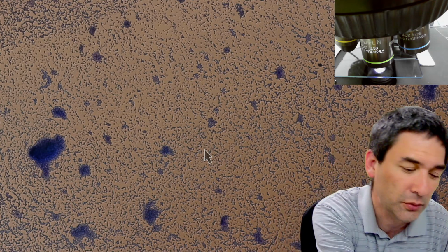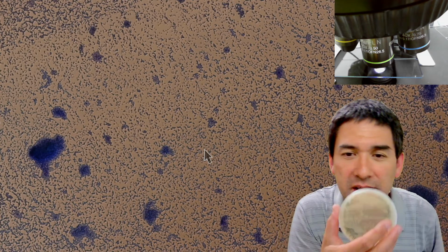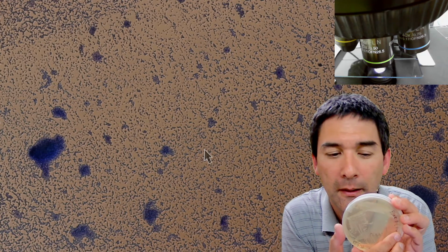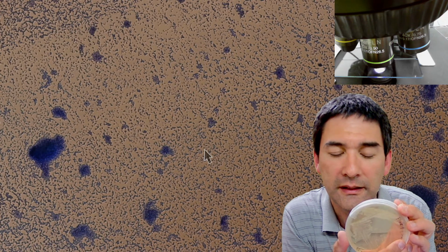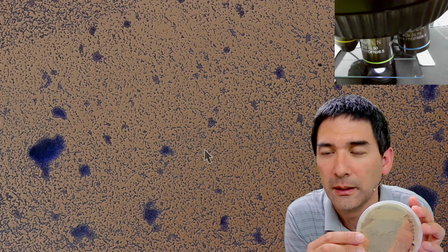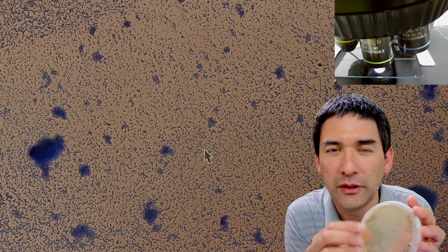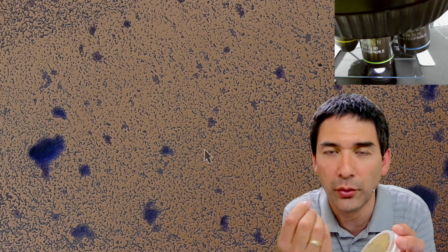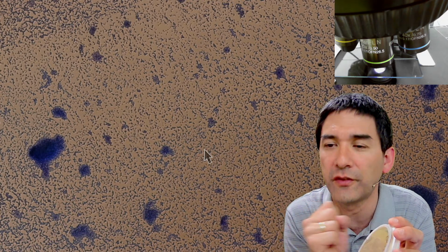So if you've got a fungal contaminant over here, it's quite possible that within a short time it's able to spread over the whole plate. That's a little bit the problem that I've seen with certain fungi.